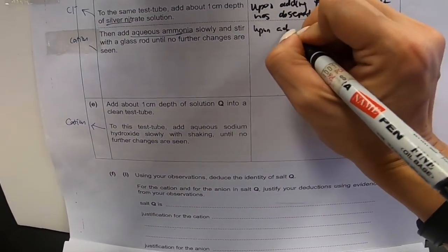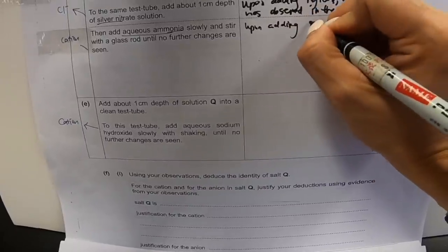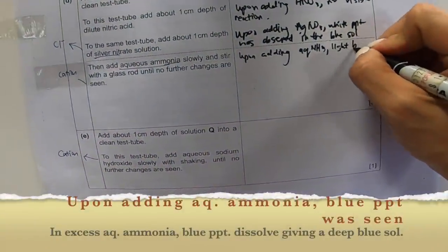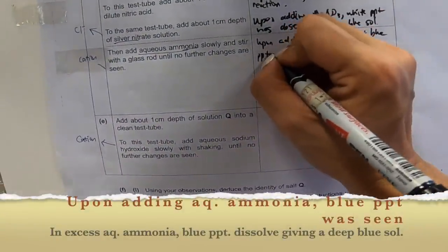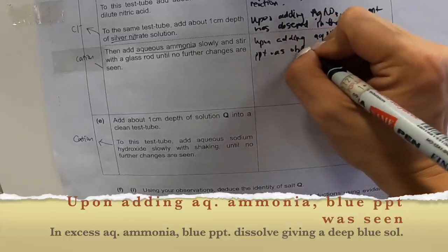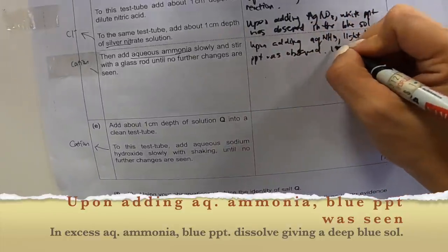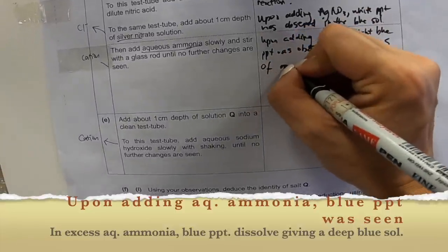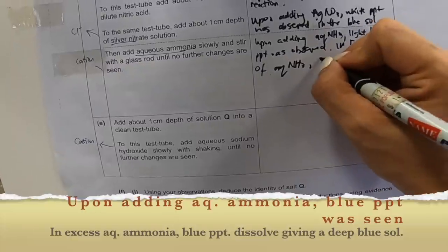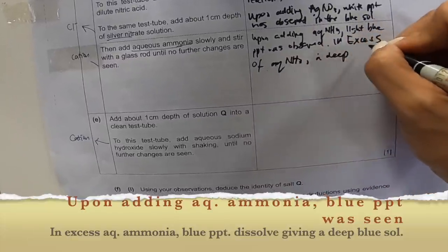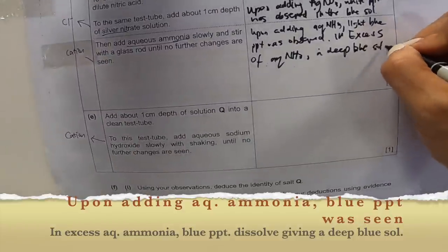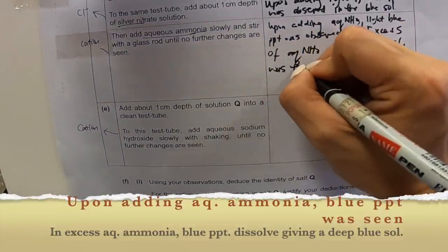They say add until no further changes is seen. It's very obvious that this portion here... I have a blue solution already. And it's a deep blue solution. So I don't even need a glass rod. In fact, I just need to see and add things slowly. So I'm going to write down my observation. Upon adding aqueous NH3, which is aqueous ammonia, light blue PPT was observed. If in excess of aqueous ammonia, a deep blue solution was formed.